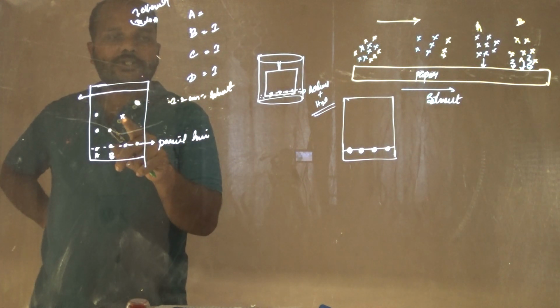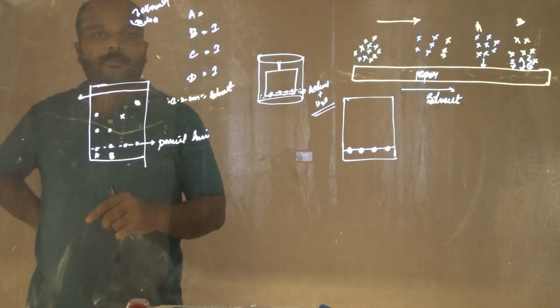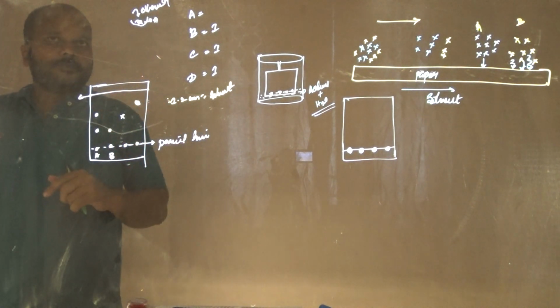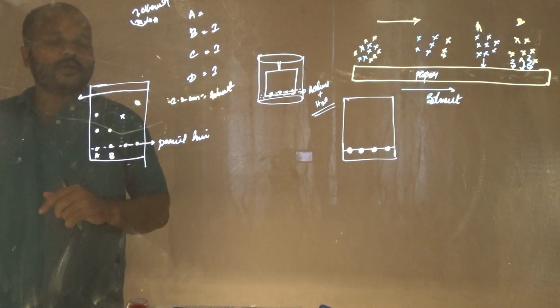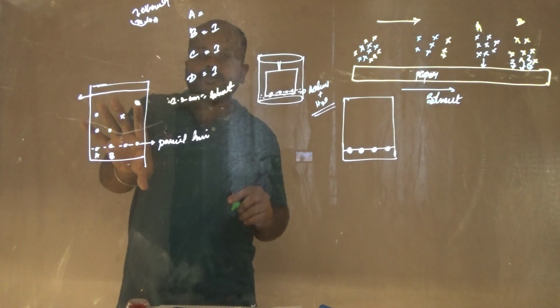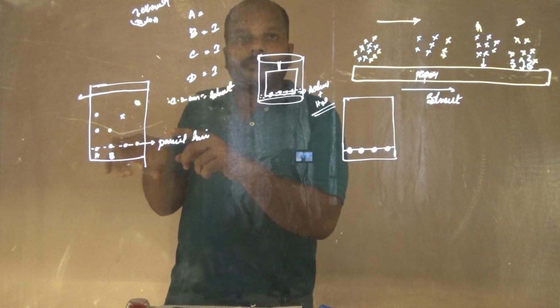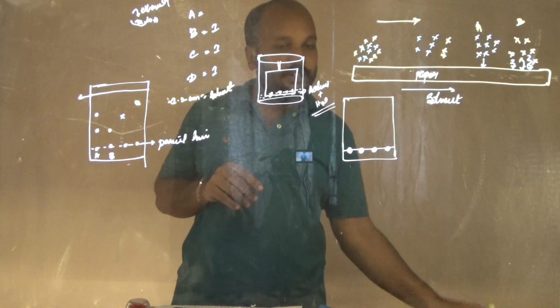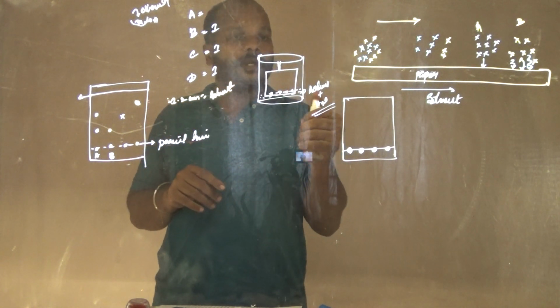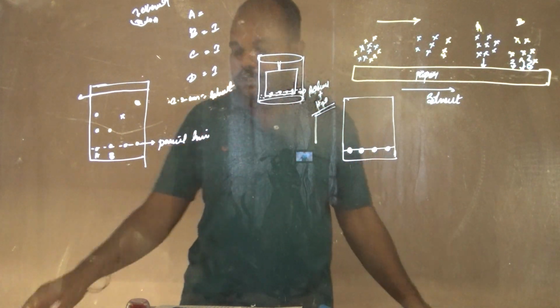So this is the distance traveled by the respective components. Okay. And one thing you can understand is, I forgot to mention something: you cannot easily see these amino acids on the paper by the naked eye. You need to use some specialized technique.